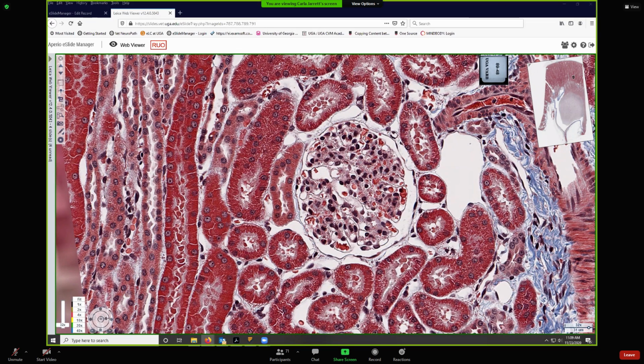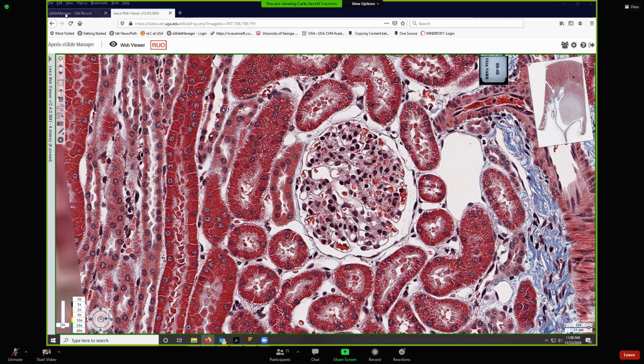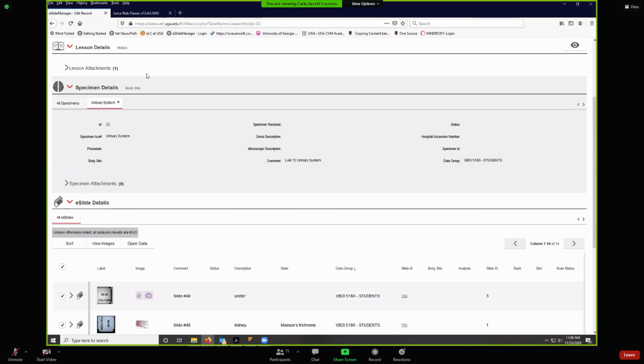Is that too far out? You haven't been thinking of the eye lately? Okay. So what about in the cornea? Can you remember basement membranes in the cornea? I can change slides. Let me do that. Let me change lessons.